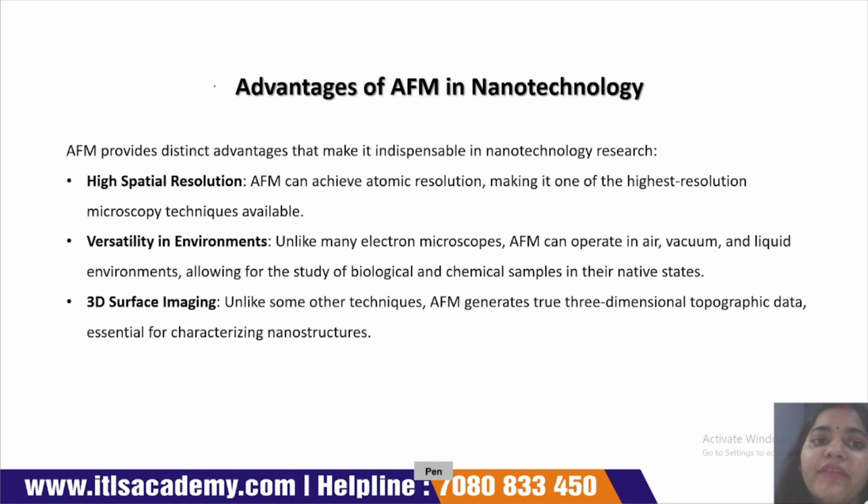Now we discuss the advantages of atomic force microscopy in nanobiotechnology. First is the high resolution image. AFM provides a high resolution image at nanoscale. Next is the versatility in environment. Unlike many electron microscopes, AFM can operate in air, vacuum, as well as liquid environment, and allows the study of biological and chemical samples in their native state. That's why AFM plays a most important role in the field of nanobiotechnology.